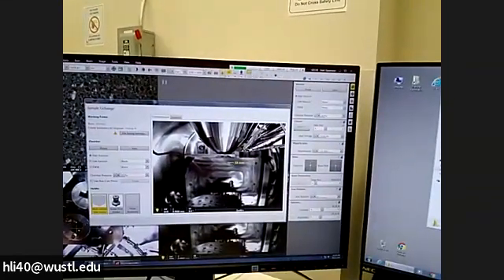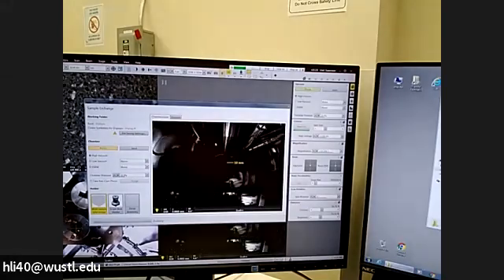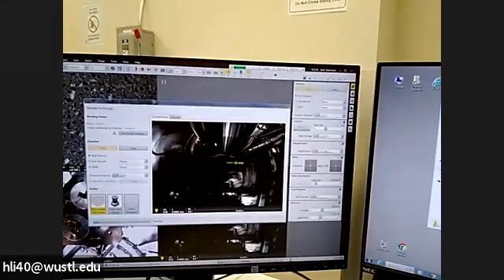And click the pump button. Make sure high vacuum is selected before you click the pump button. Select no accessory. And put the door in the middle of the sample room. You can hear the noise, it has started pumping already. So we wait a minute, then you can log off your QR code, then enter the session.